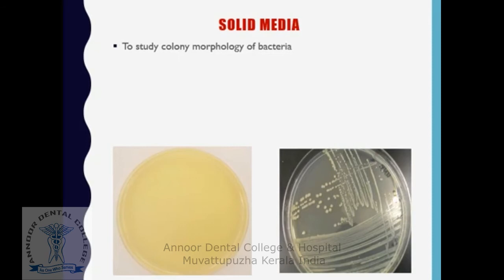So, when you cultivate bacteria in a solid culture media, the growth of bacteria is observed as colonies. Each bacteria has a typical colony morphology, so that can be easily studied by using a solid media. In solid media, you can study special characters of bacteria like pigmentation, that is colored end products, whether bacteria can produce or not. Then hemolysis, lysis of RBCs, is studied in solid culture media.